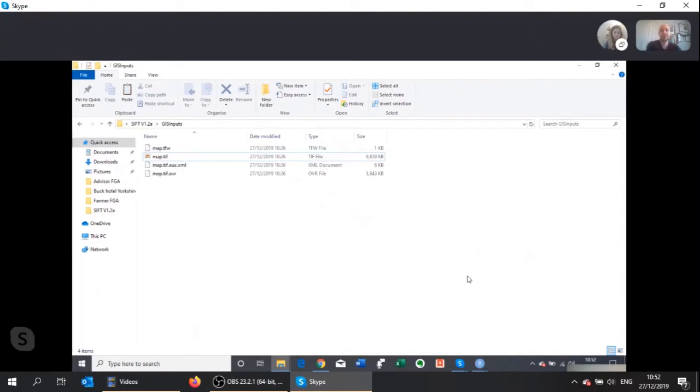Another thing to mention is I'll show you the map when we run the software, but if you've got sediment samples, it's also worth drawing some arrows in and marking on the map where each sediment sample was taken from, just because the software hasn't got built in the ability to plot the sediment samples itself. We'll see later how I did that. Okay, so if you switch back to R and the app we've got running.